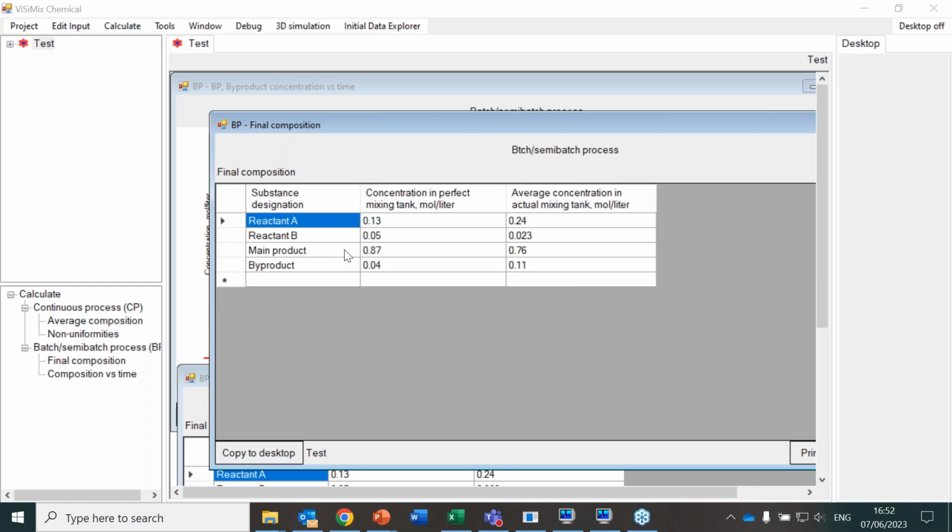And the connection with people that will transfer this process to the next step, to the next facility, will be more straightforward, because they are talking about the same base, a base that is very common for everyone working in synthesis, in chemistry, in the lab.